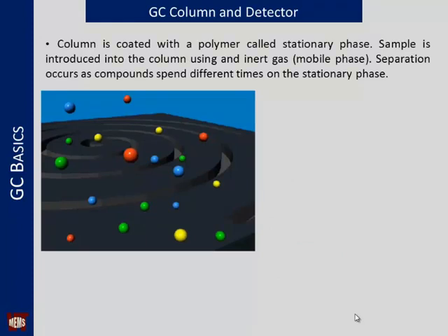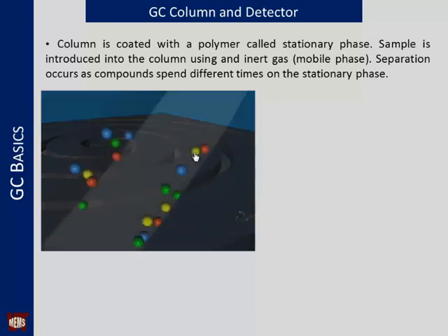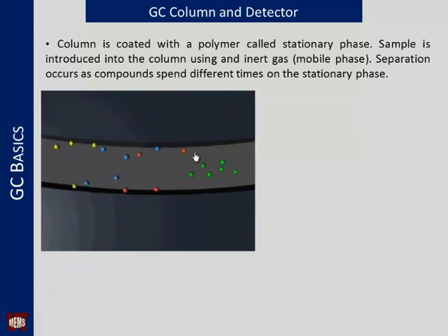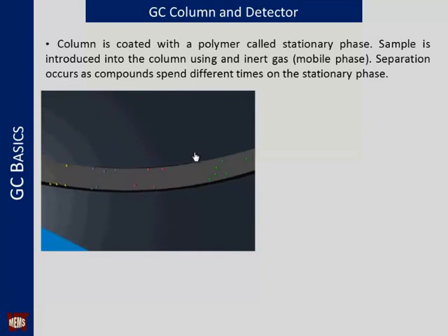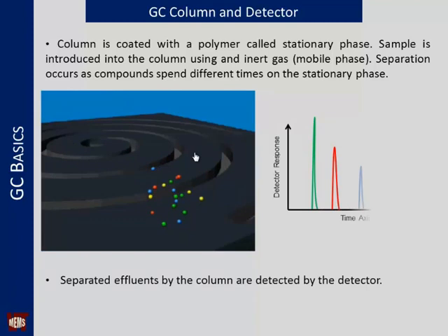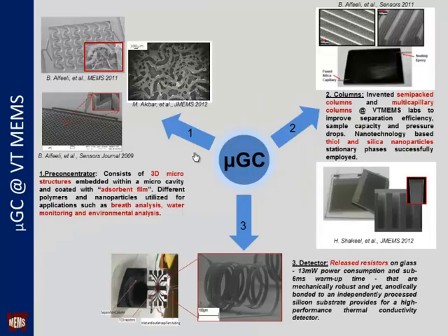The separation column is basically a long tube coated with a polymer called the stationary phase. Different molecules interact differently with this polymer as they are pushed by the carrier gas, which is an inert gas such as helium or nitrogen. As a result, they travel at different speeds and get separated over time and space, as you see here. As they pass over a detector, it creates the chromatogram. The retention time, which is the time each compound spends in the separation column, determines the compounds present in the sample.